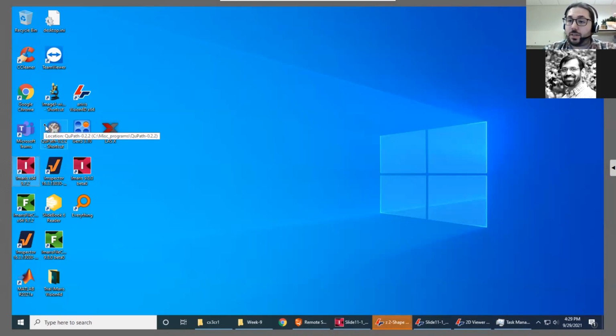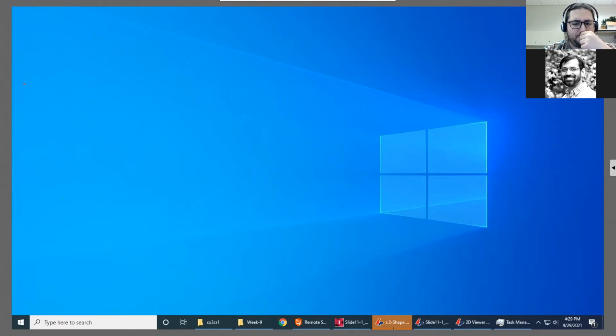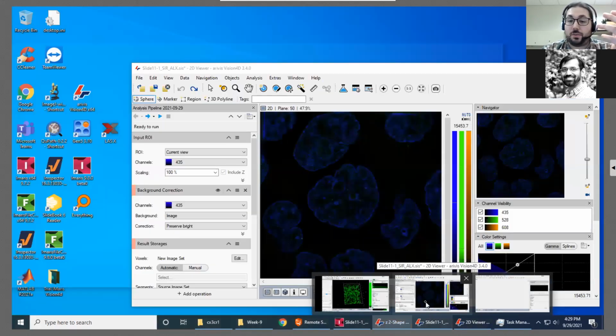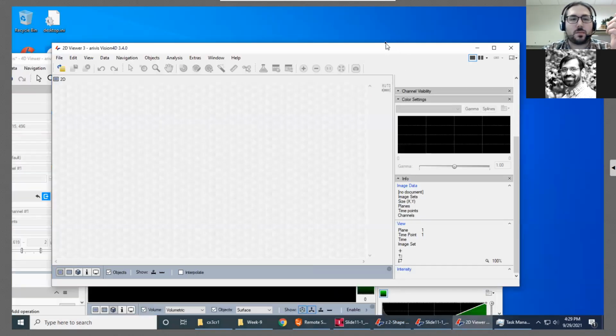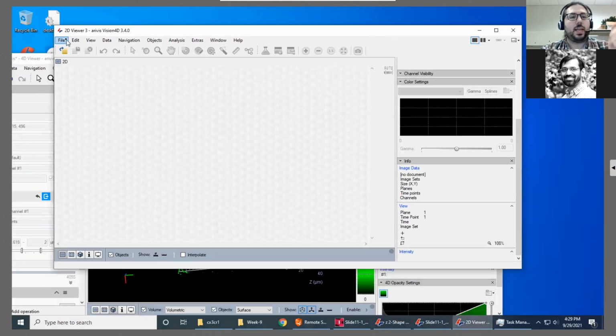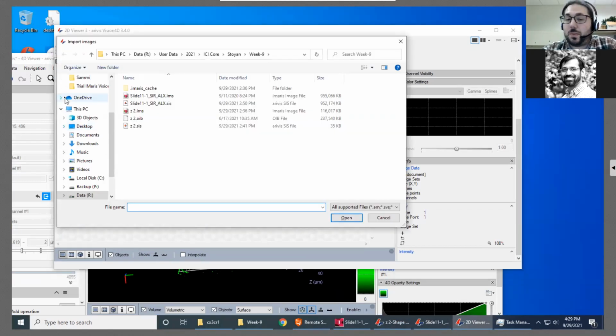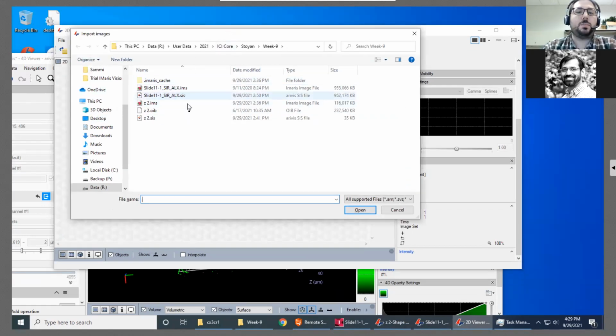Generally, if you can, you want to use the most modern, the newest version of both of these. And this is just the desktop on Workstation 0, so you can access Vision 4D here, Imaris 9.72. And in fact, in the near future, they are releasing a newer version of Imaris, 9.8, I believe, that includes improvements to its performance. So that's something to check out if you find it interesting and potentially useful.